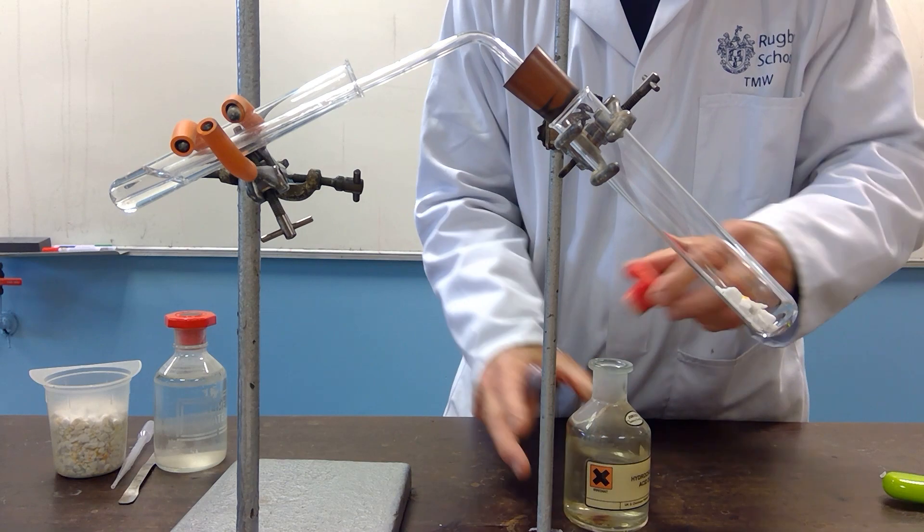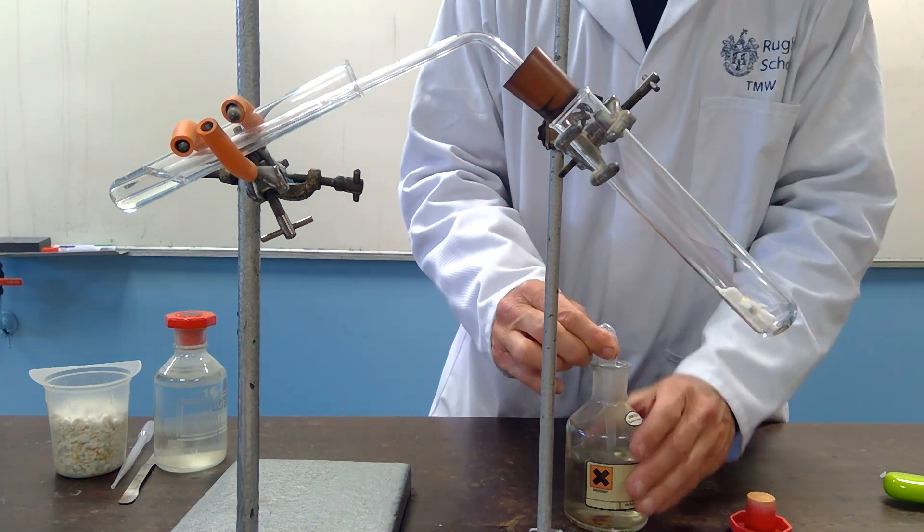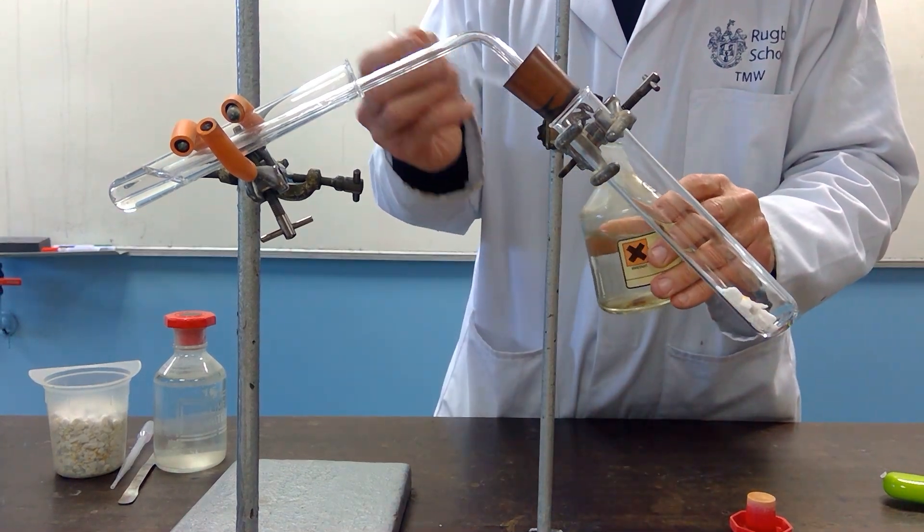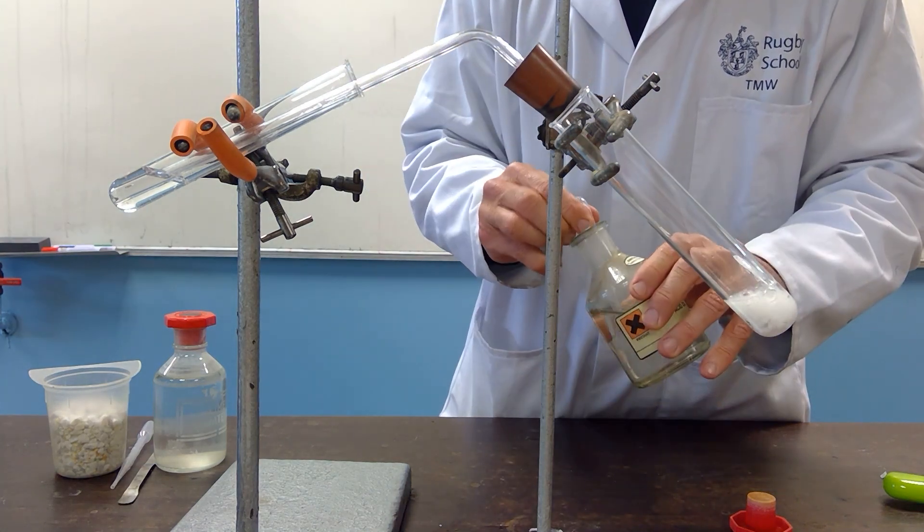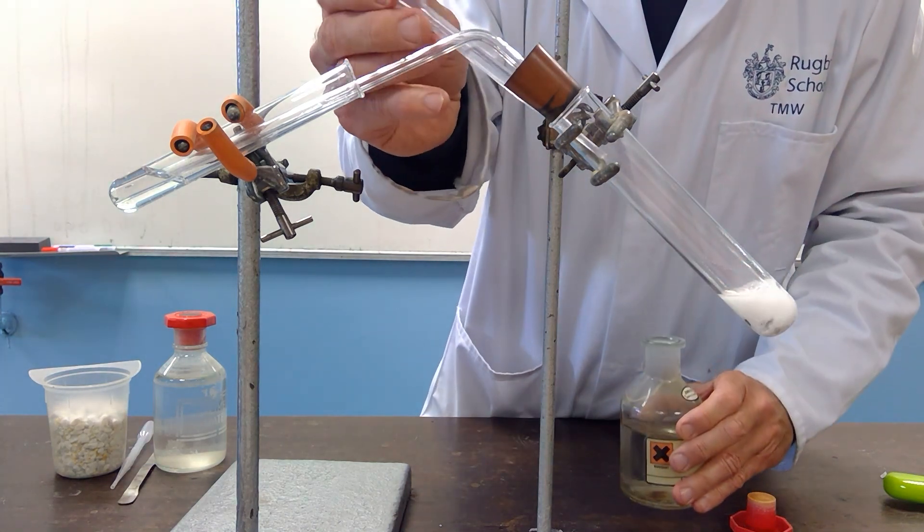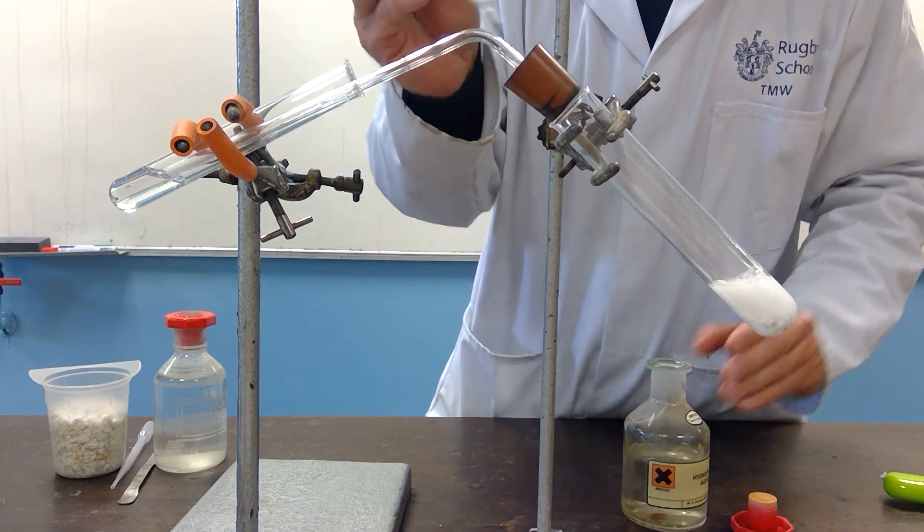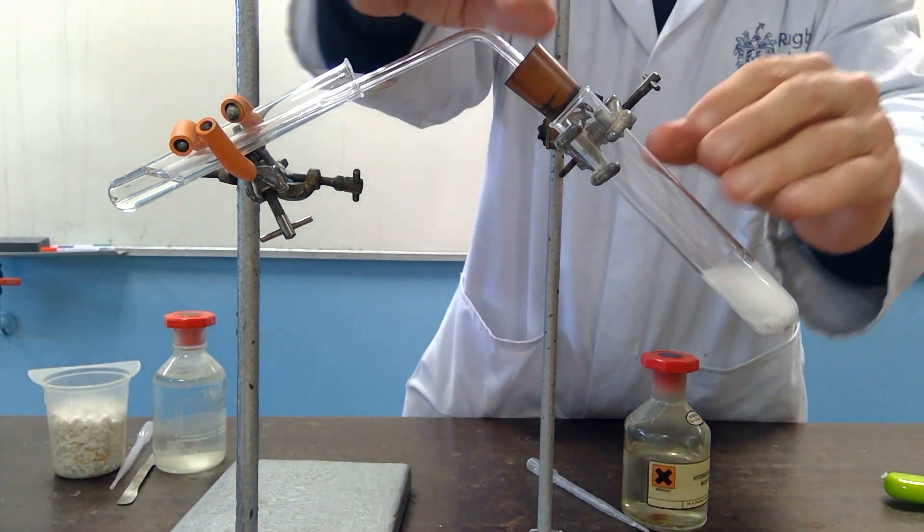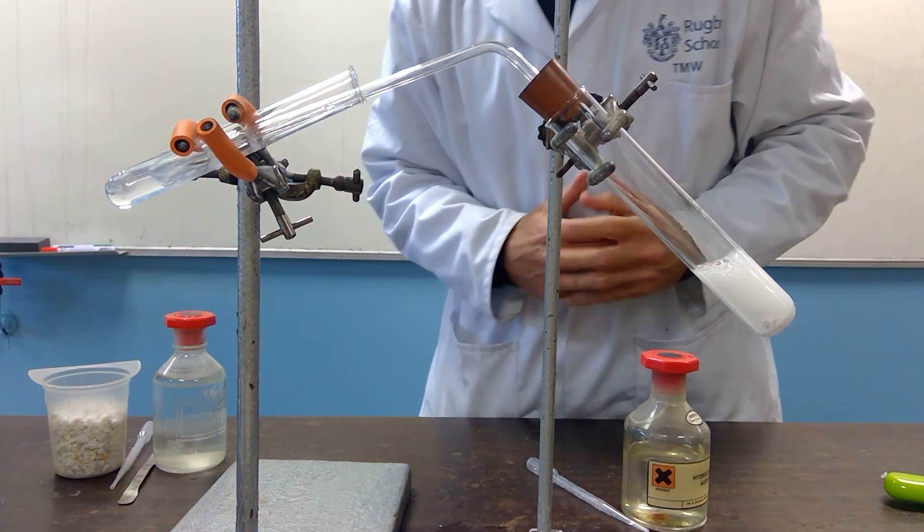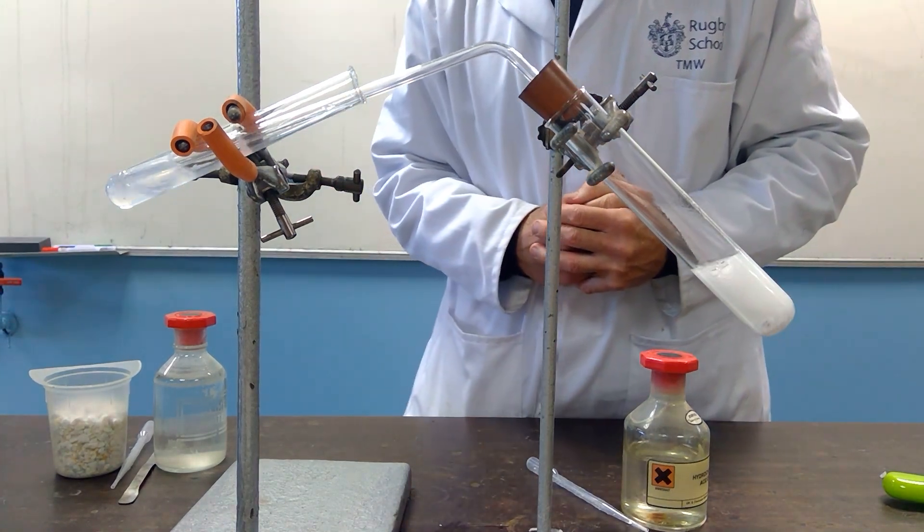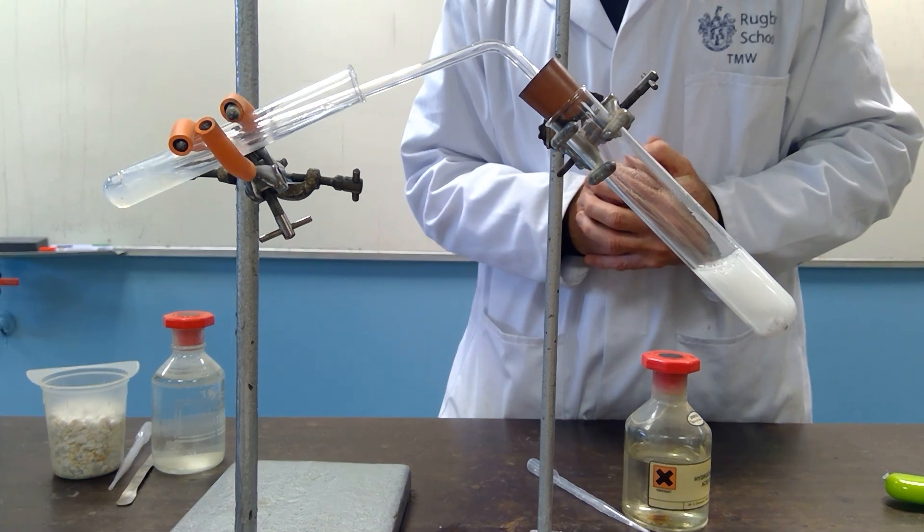So, the hydrochloric acid is added and the bung is placed on as quickly as I can. Immediate bubbling. If you place the bung into the top, you can see it bubbles through the lime water in exactly the same way as before. The lime water, of course, goes cloudy.